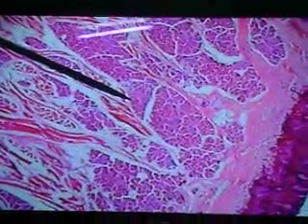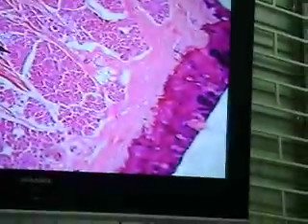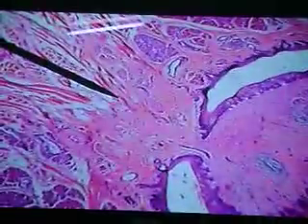Okay? Alright. When we look at the overlying mucosa of the tongue here, we see a prominent lamina propria, and within that lamina propria we start to encounter some of the glands. Alright? And these glands here, sometimes we may find purely mucus type, some of the lingual glands are mixed glands, and there we see the lamina propria here extending up into this circumvallate papillae.